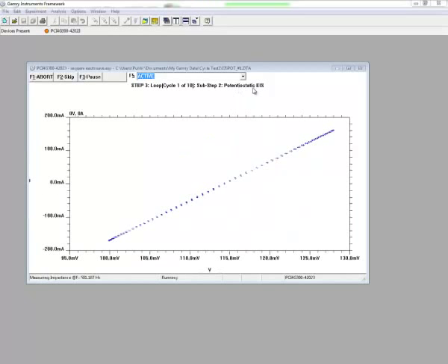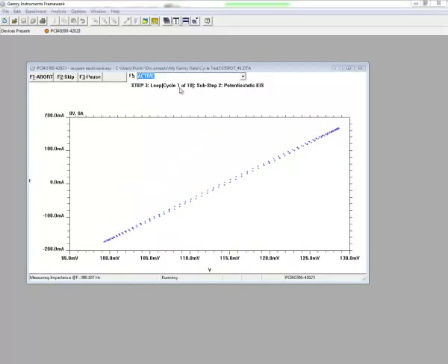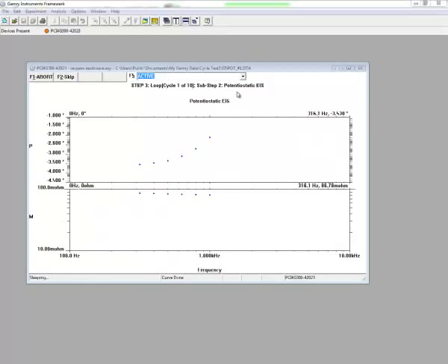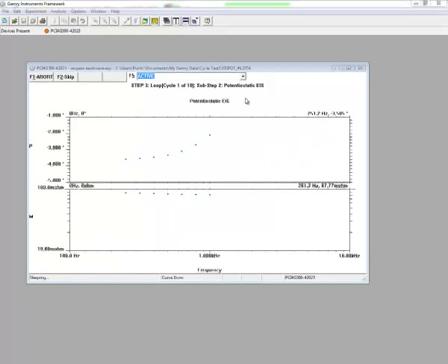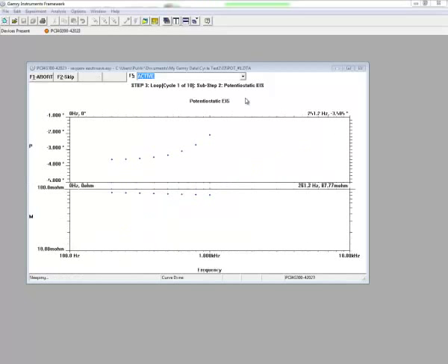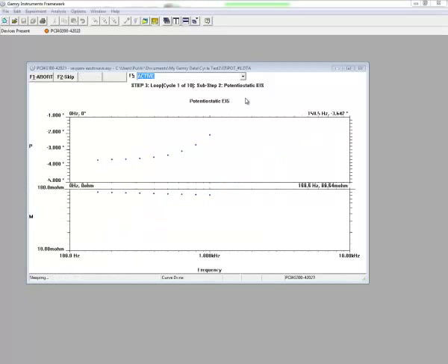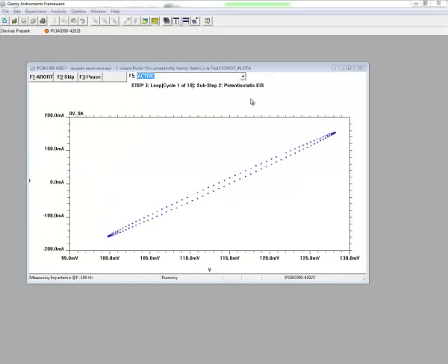And once potentiostatic EIS finishes, then we move into cycle 2 of 10, and we start again with cyclic voltammetry. So this is a simple explanation of how you would set up a sequence using the loops.